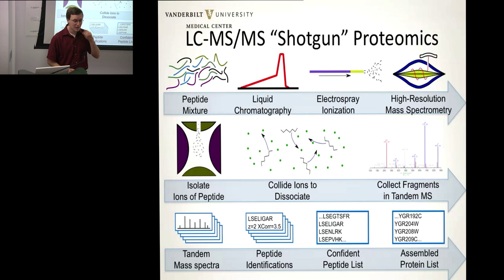So here you see we have started with a mixture of peptides at the upper left. We're starting with these peptides, and we're going to use some sort of separation on them.